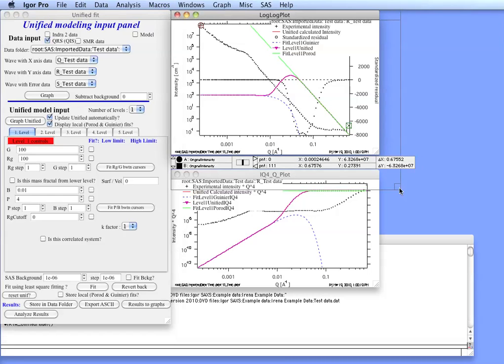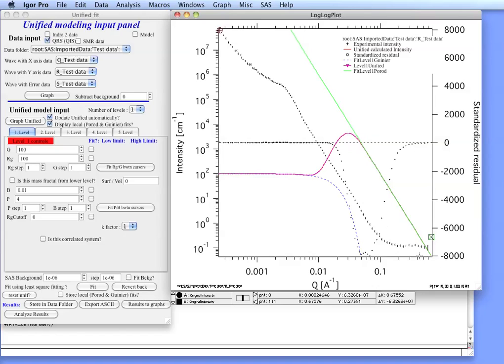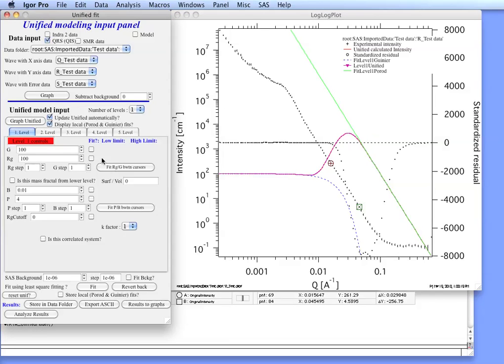Now we can make this bigger so you can actually see better. What we need to do first is bracket the area which we'll use for fitting. The Guinier area is, the hint of it is somewhere out here. And you can see this blue curve would be the Guinier. So we can then select the range in which we want to fit the data. We select which parameters we want to fit. We want to fit these.